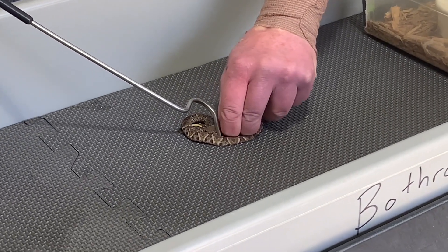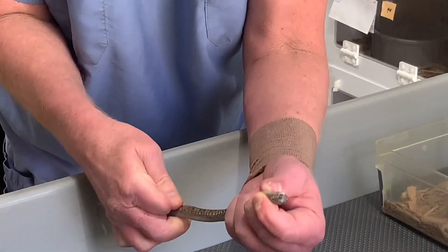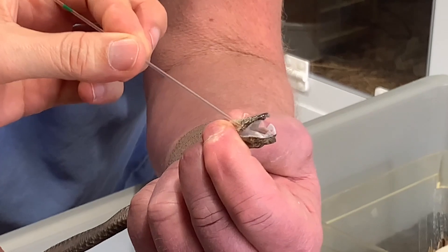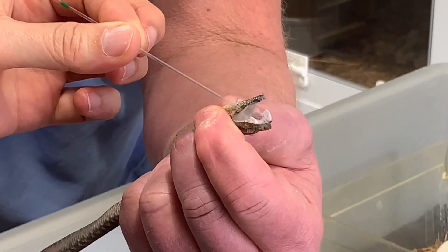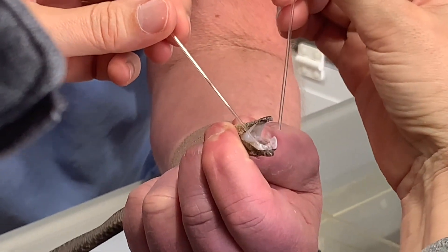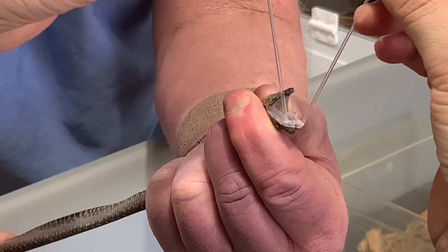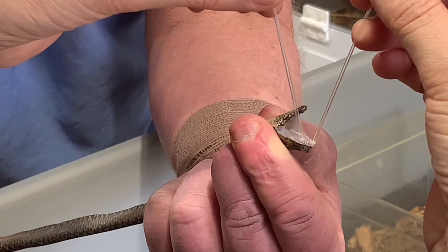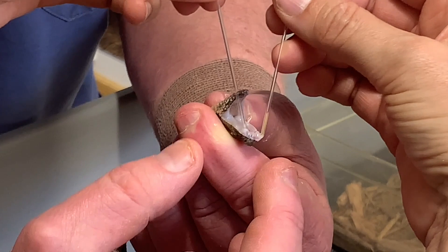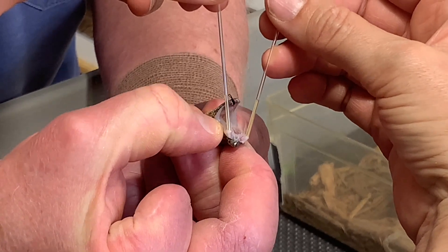Right here, he is taking a capillary tube — like a little glass straw — and placing it over the top of that fang, right in a little bit. Yeah, a little bit. Got him!